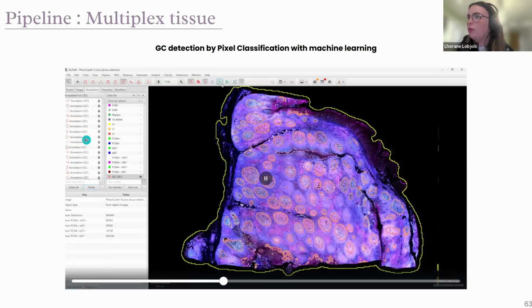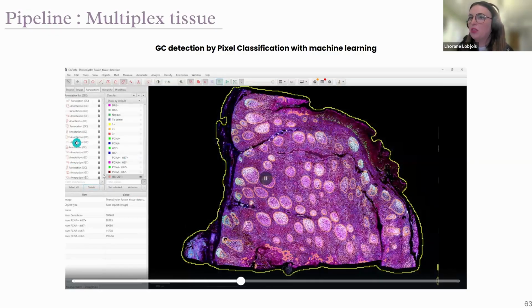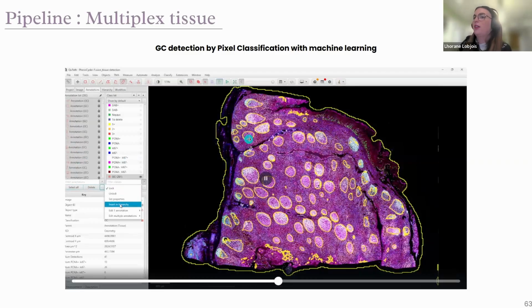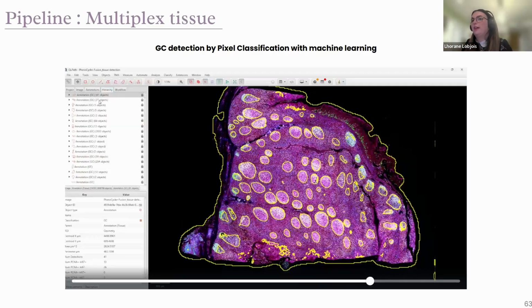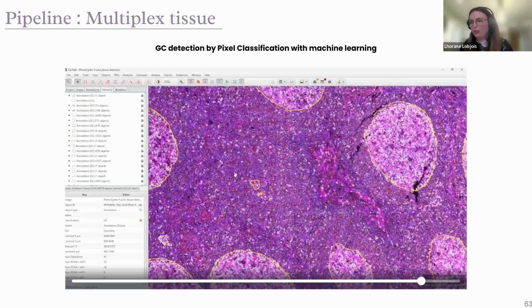And you see that I don't remove a small object, so that's why I have something like it's not a good object. And you have the option insert in hierarchy. That means if you don't create the objects in a good way, so not in the right order, you can click on that and you will understand which one is inside which, like the Matryoshka dolls, if you know what I mean.